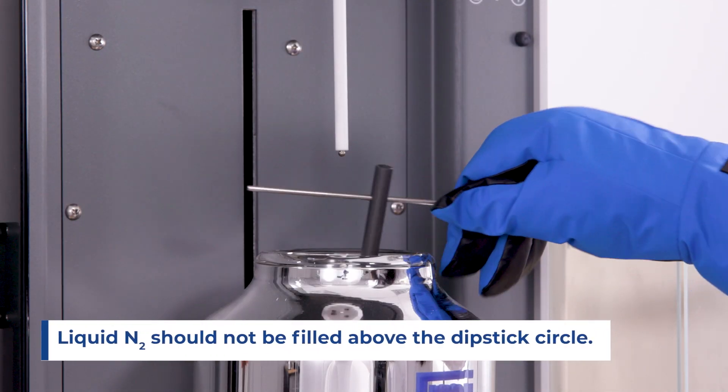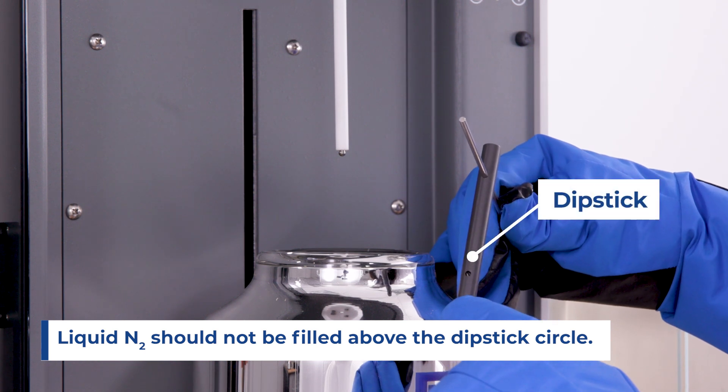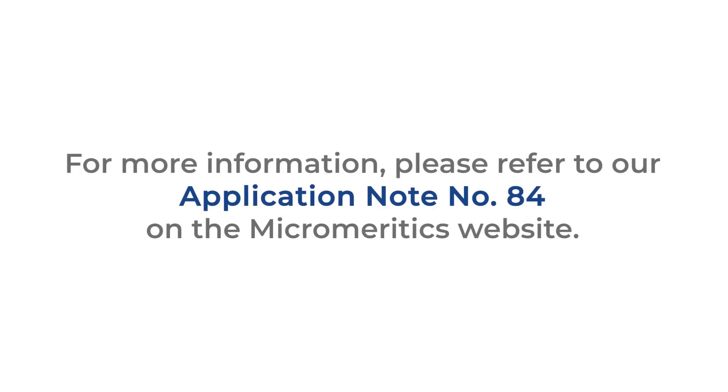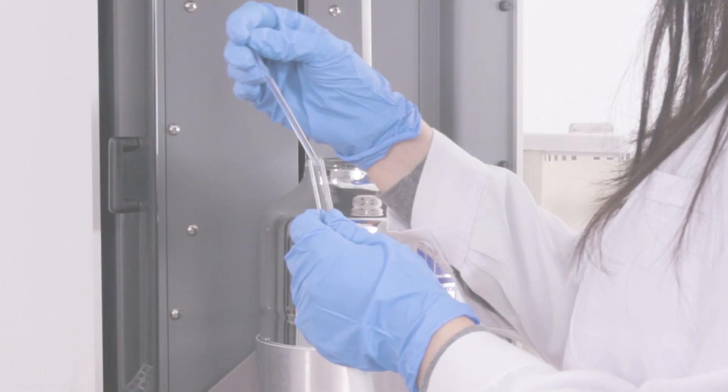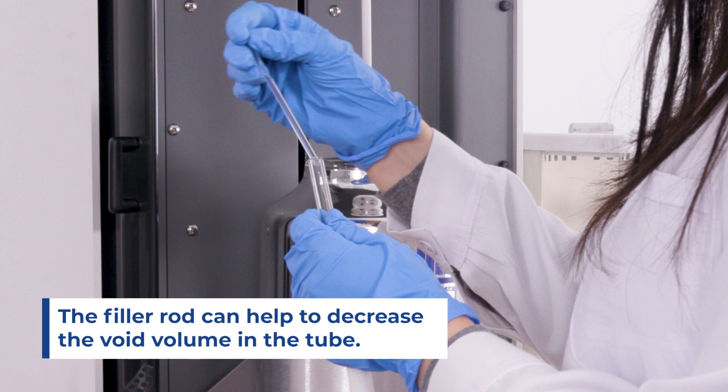Also, liquid nitrogen should not be filled more than the circle on the dipstick, since it indicates the top of the jacket when the elevator is raised. For more information on how this affects the data, please refer to our App Note 84 on the Micromeritics website. The filler rod can be used to decrease the void volume in the tube, especially for low surface area material, to minimize any potential error from the free space.